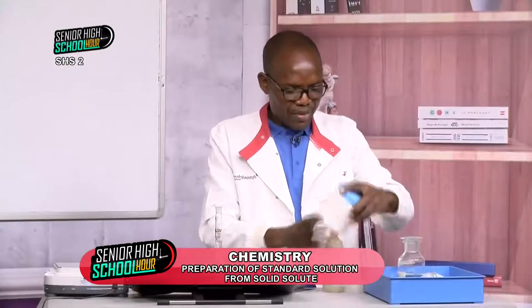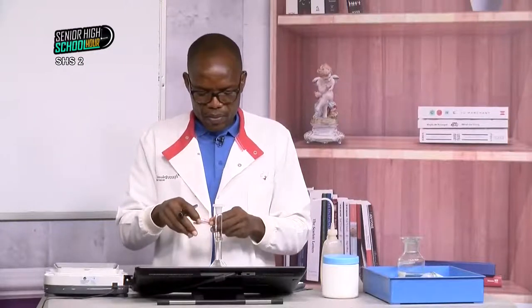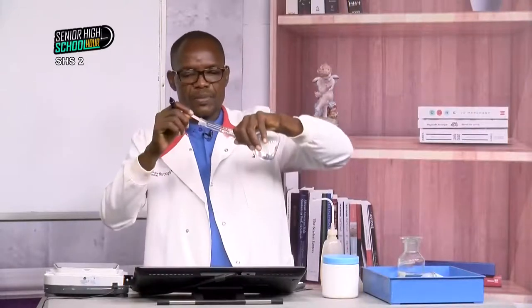Now, is it true that there is something inside this thing? Let's test and see if it is really true that there is something. So I have my litmus paper here. This is red litmus paper. Wow, yes, there's something, see, it has turned blue. So it means that this solution is basic. It turns red litmus paper blue.